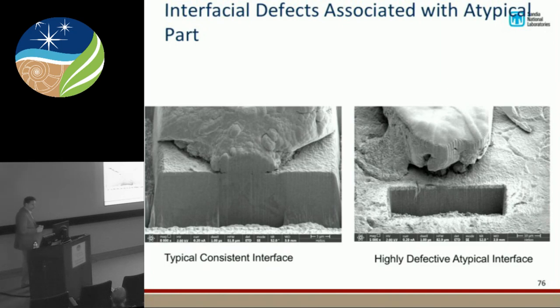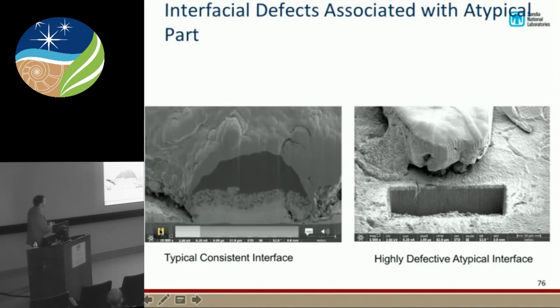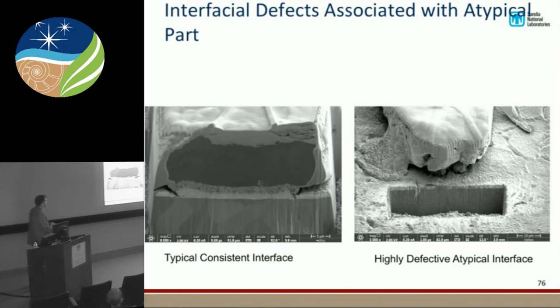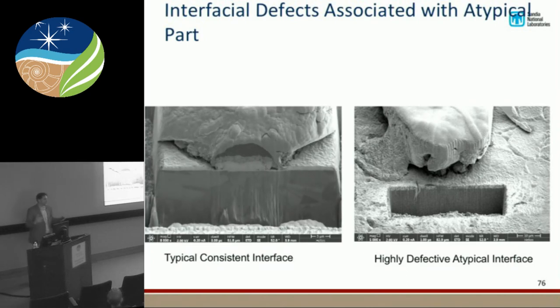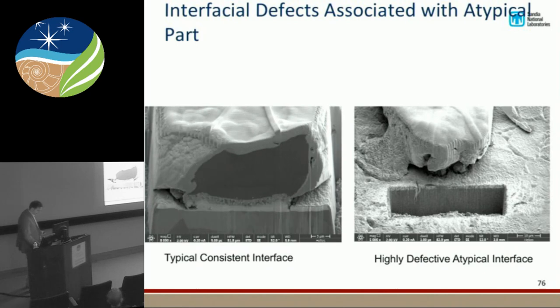Okay, I'm going to show you here, we're looking at it with the SEM, and the FIB is going to cut from the top, and I'm going to show you what that interface looks like. So we're moving through this, and you can see, sorry, the mag changes a little bit. You can see this is the interface here that we care about. You can see a nice, continuous gold aluminum bond here, and that's what a good part would look like. So when all this goes well, everything's good.